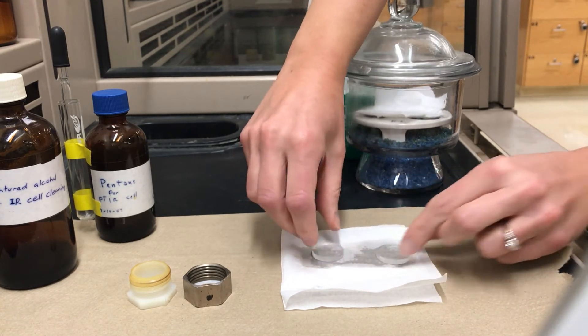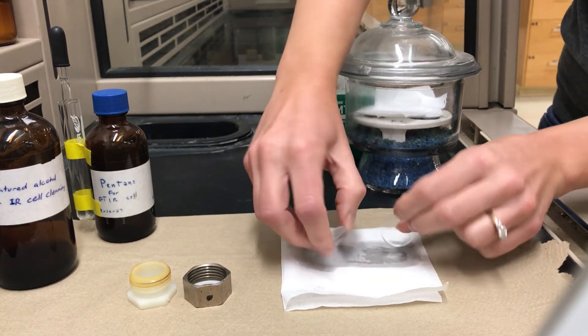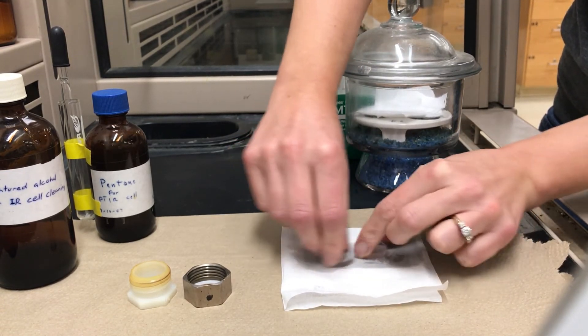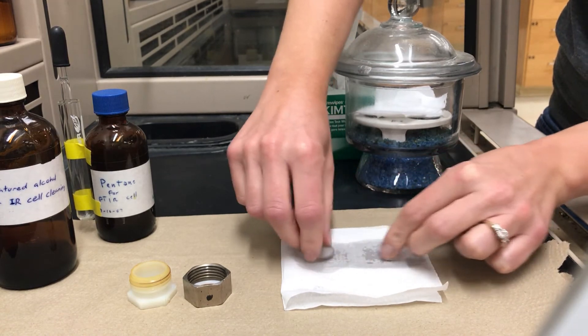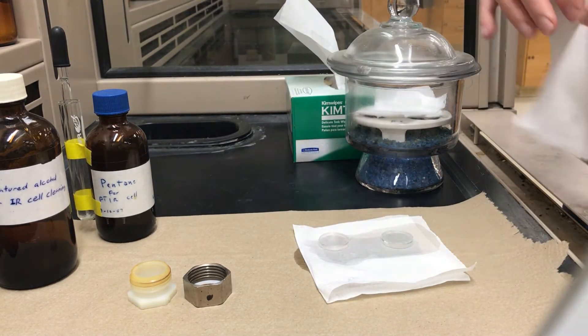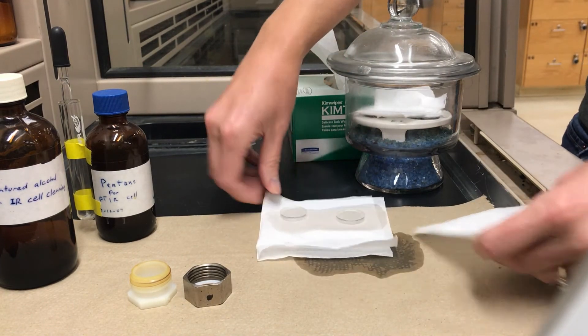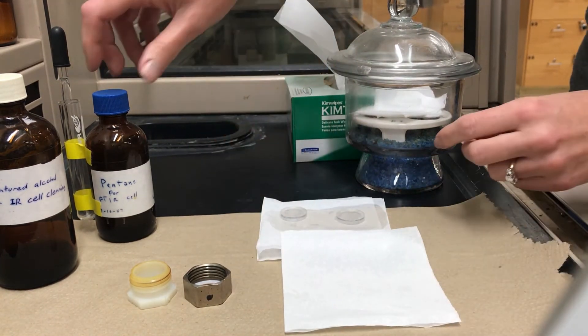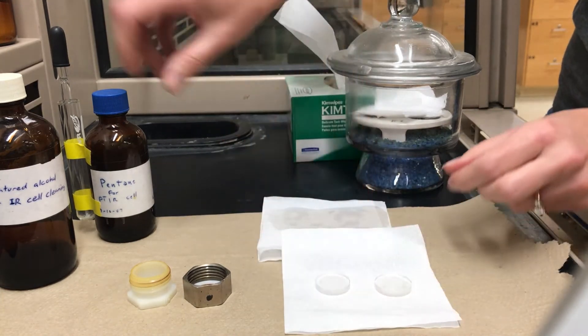So touching them on the sides I can rub the surfaces on that wet kim wipe and then that will clean the surface off. Next I get a second kim wipe and I put the plates on there because I'm going to use a different solvent.